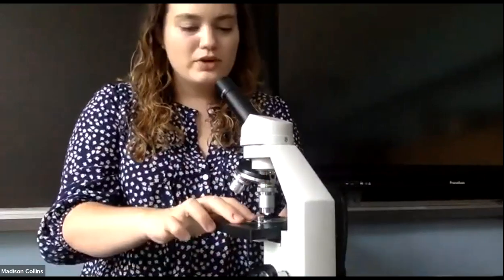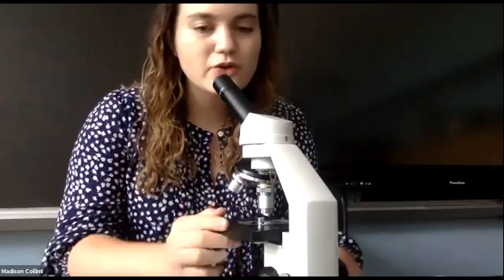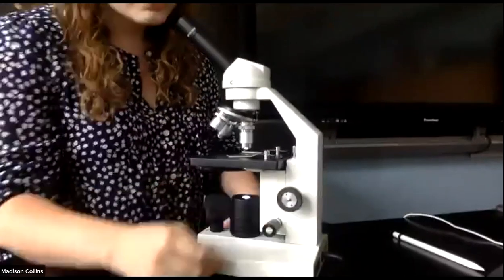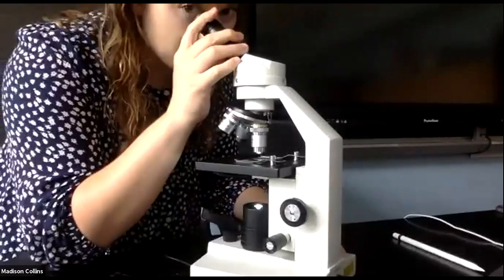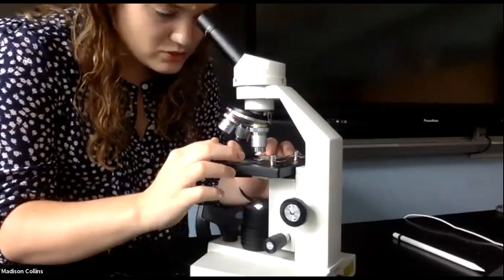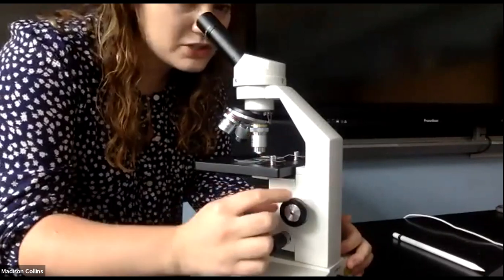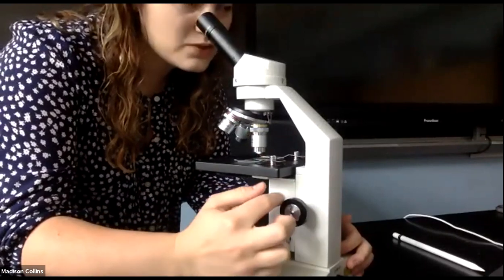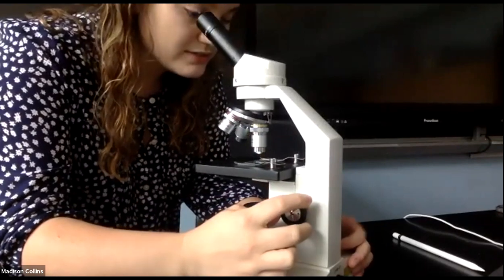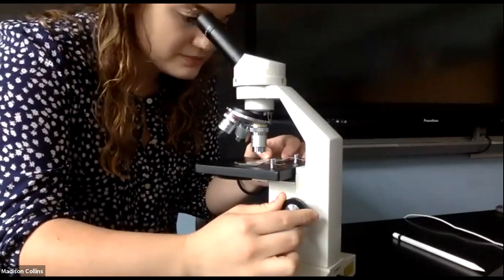Okay, now when it comes time to actually look through the microscope to view your specimen, you're going to use these two tools right here. So when I view the specimen through the eyepiece, notice I've got it on the low power objective right now. If I want to make that object become in focus or become more clear, I'm going to use this coarse focus or coarse adjustment right here. So I'm going to twist it and turn it until I'm able to find, let's see where my object is.